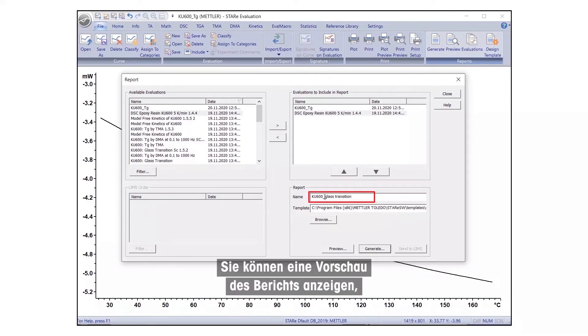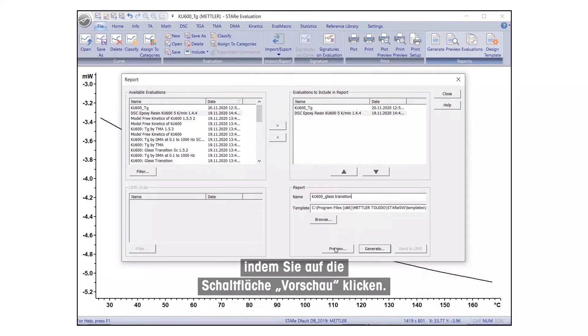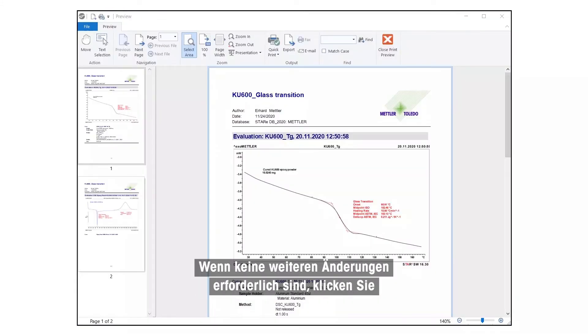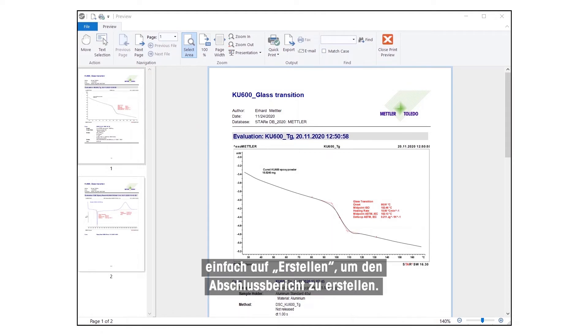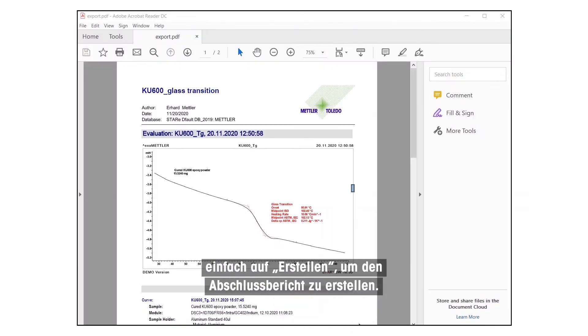You can preview the report by clicking the Preview button. If no further changes are needed, simply click on Generate to create the final report.